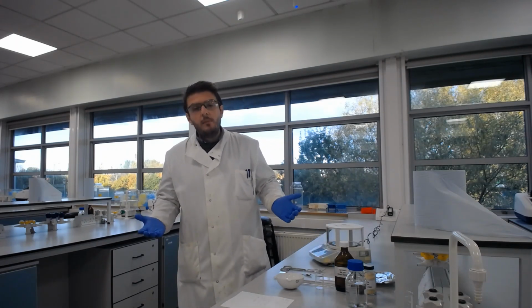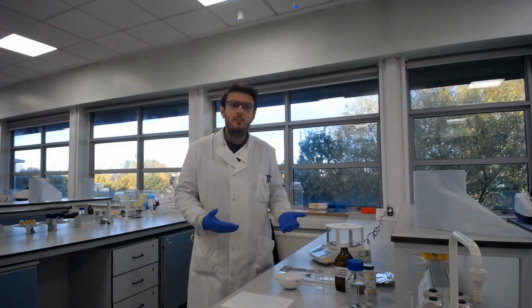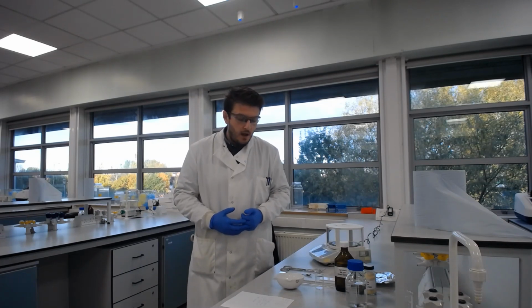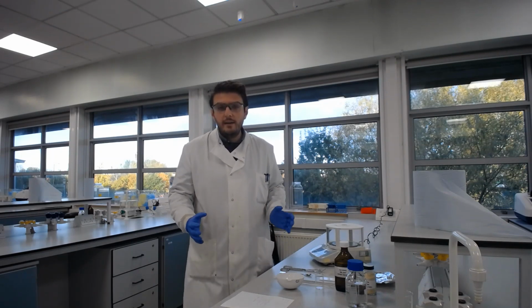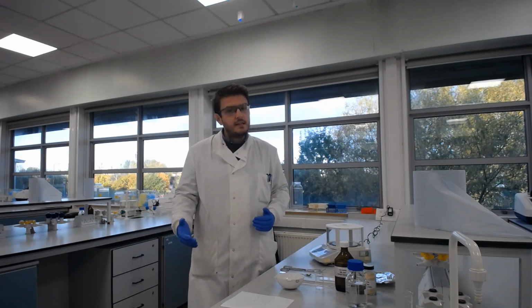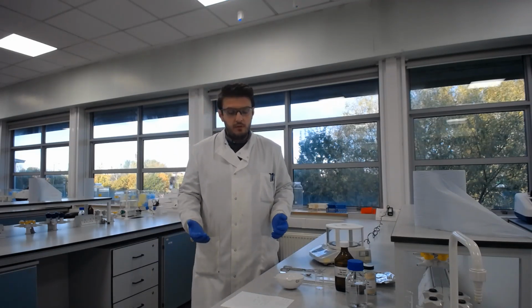So for 10 1 grams, we need to make 10 grams worth of our mixture to put into the molds and have an excess for any spillages or whatever that we make. The easiest thing to do for this, with the percentages, is to do everything by mass or weight. So we're not going to be using millilitres for water or millilitres for glycerol. We're going to be using grams for that.